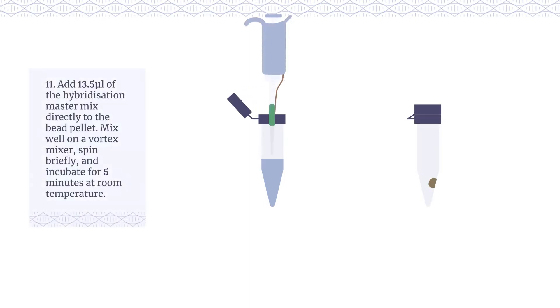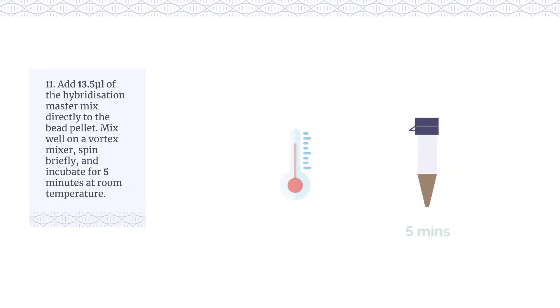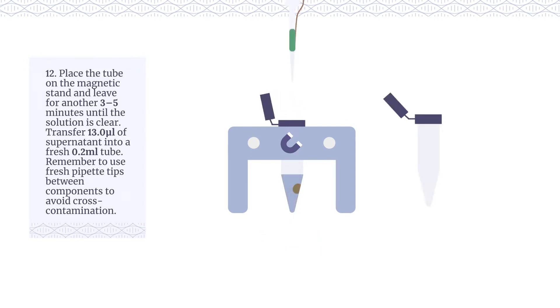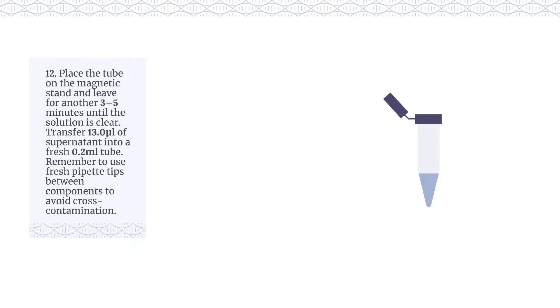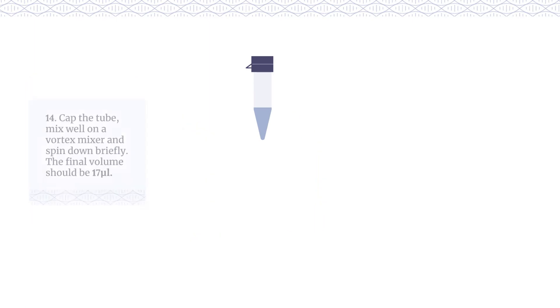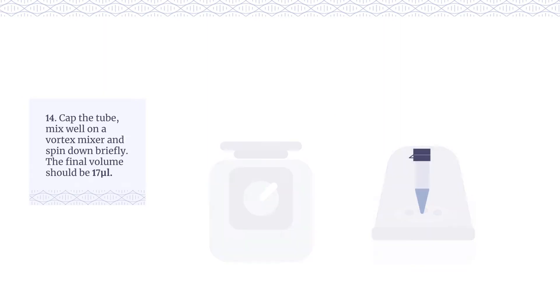Add 13.5 µl of the hybridisation master mix directly to the bead pellet. Mix well on a vortex mixer, spin briefly, and incubate for 5 minutes at room temperature. Place the tube on the magnetic stand and leave for another 3-5 minutes until the solution is clear. Transfer 13 µl of supernatant into a fresh 0.2 ml tube, using fresh pipette tips between components to avoid cross-contamination. Add 2 µl of index blockers and 2 µl of SureSeq or CytoSure panel-specific baits to the hybridisation reaction. Cap the tube, mix well on a vortex mixer, and spin down briefly. The final volume should be 17 µl.